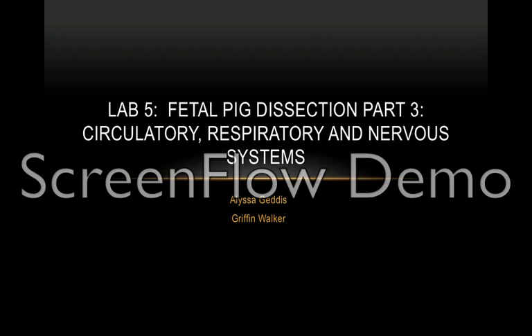This is Lab 5, the fetal pig dissection, Part 3, Circulatory, Respiratory, and Nervous Systems, by Alyssa Geddis and Griffin Walker.